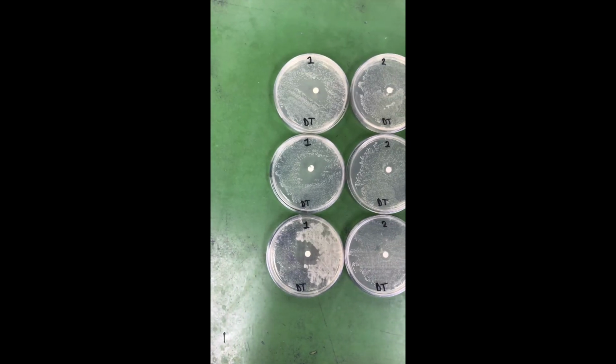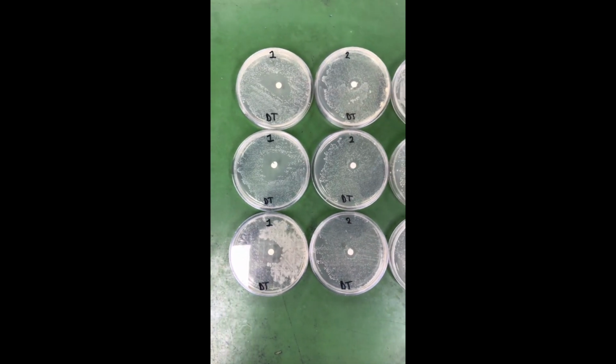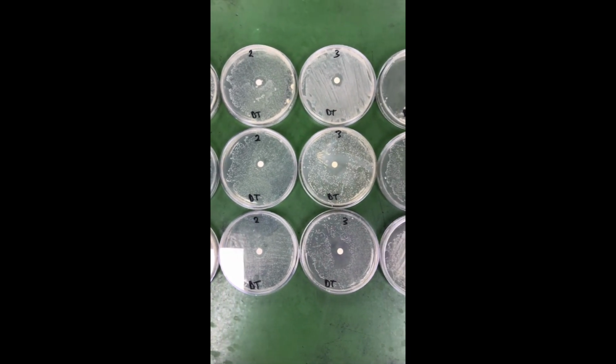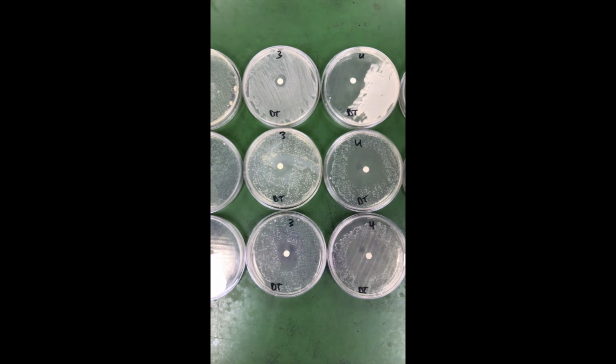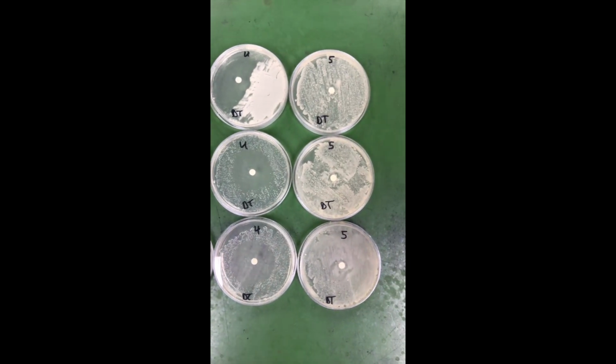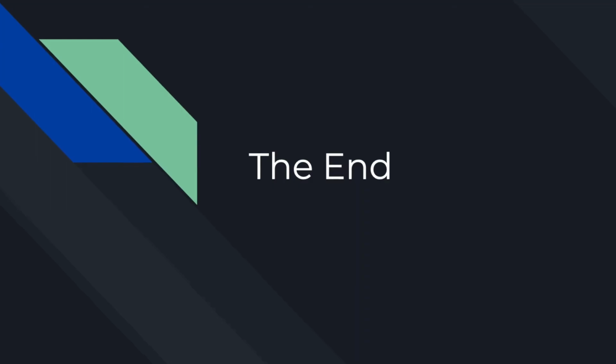Here you can see all the tests that I did on my products. As you can see, most of my products had decent sized zones of inhibition, which show that they were effective as antibacterial drugs, but there's still room for improvement. The end.